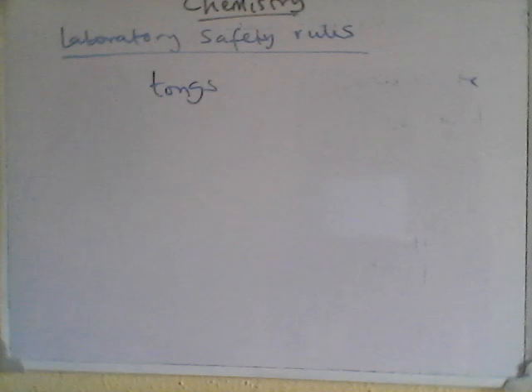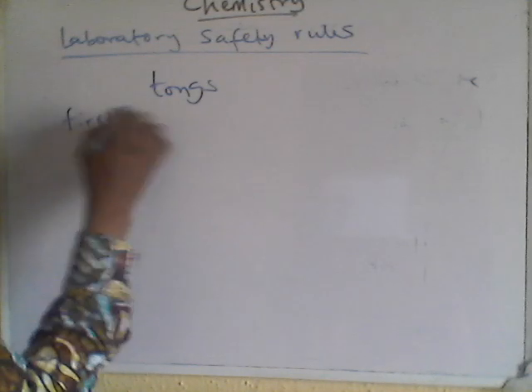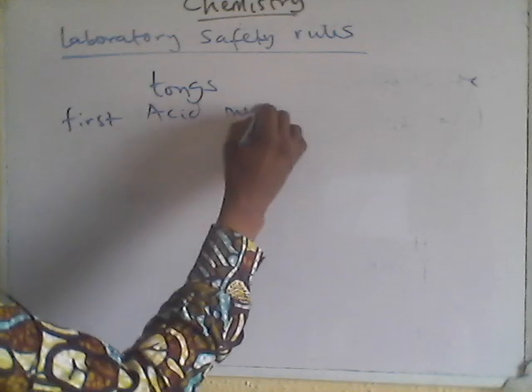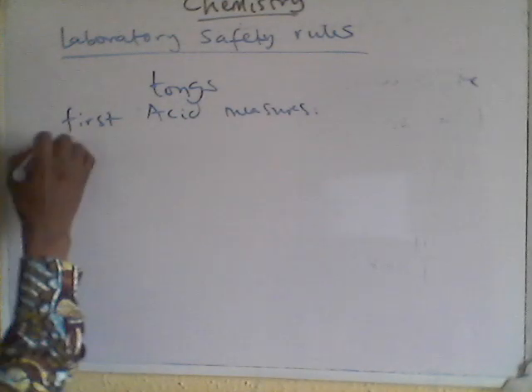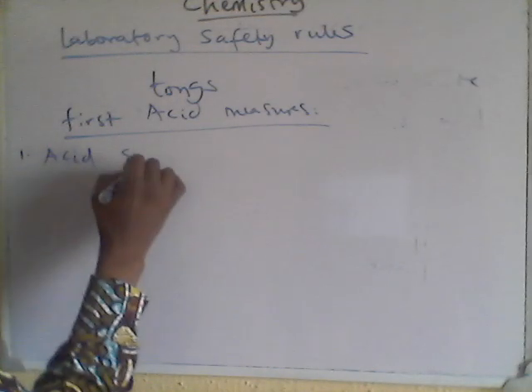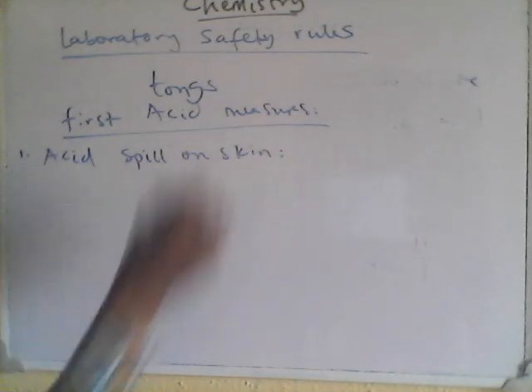Now first aid measures. What will you do when an accident happens? I'll just put it on the board. Number 1, acid spilling on skin by accident.